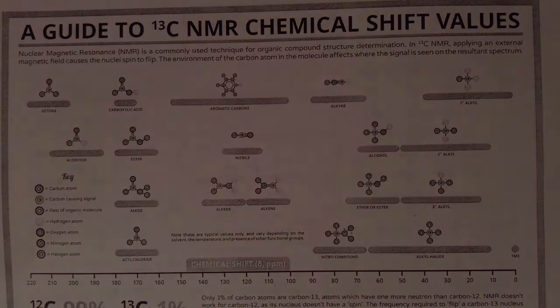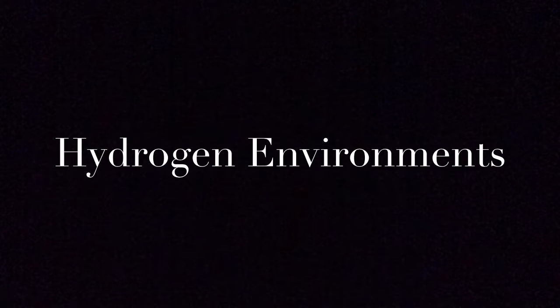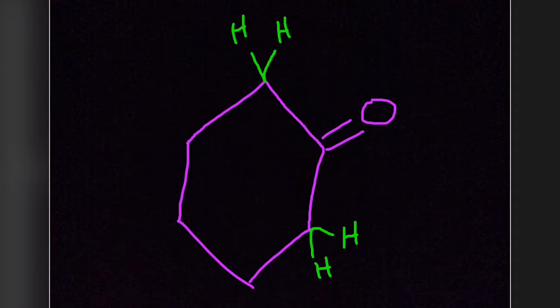Okay, so after looking at the graphs, let's go back to the structure and determine the different hydrogen environments. When looking at the different environments, we have to consider the structure's symmetry, which means that there are going to be less signals, or if it's going to be asymmetrical, which means there are going to be more splitting. So for this structure, it looks pretty symmetrical except for that ketone. So it's not completely symmetrical. There's going to be a split.